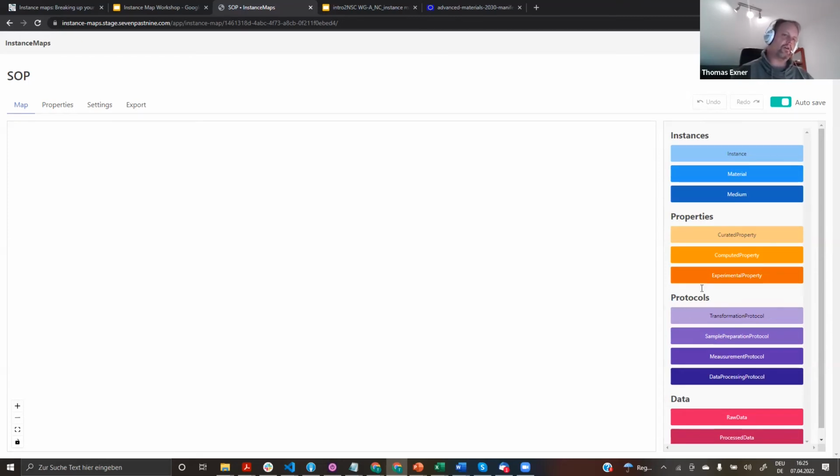We probably would have protocols exactly describing these cell model controls, which are outside of the main flow, but in principle these side branches which Ben already had very nicely in his instance map. But we could also think about supporting that better by having specific nodes for that.